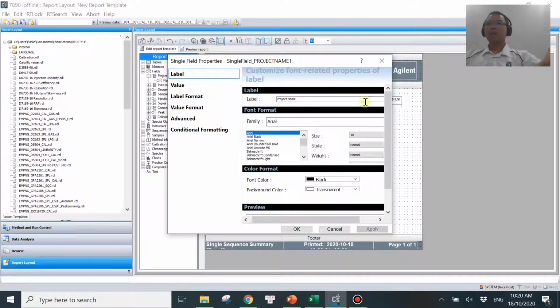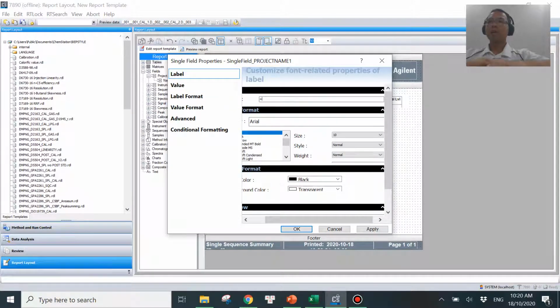You can put something like equal to code, LOD of, space, and compound name. So that will appear for me as LOD of compound A, LOD of compound B, something like that. You can add something like this, equal to something like this, right? LOD of compound A, or you can put it as, or something like that. It's up to you, right?